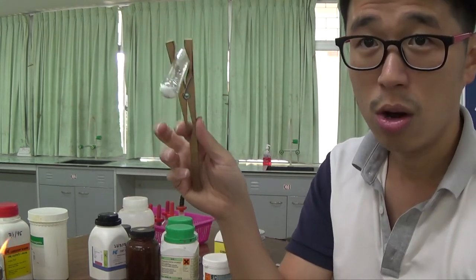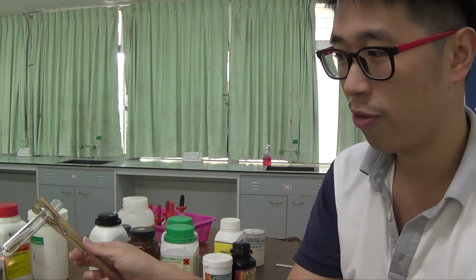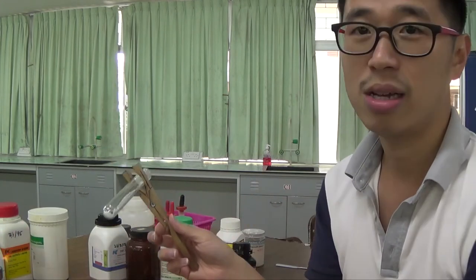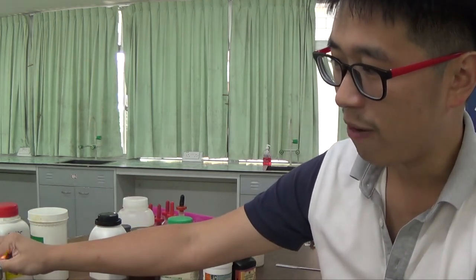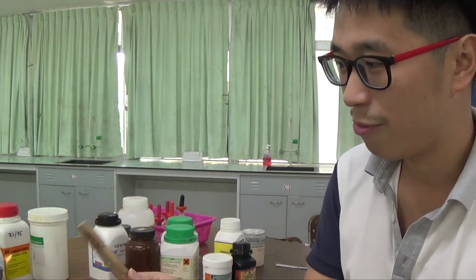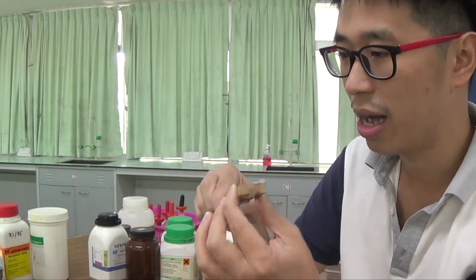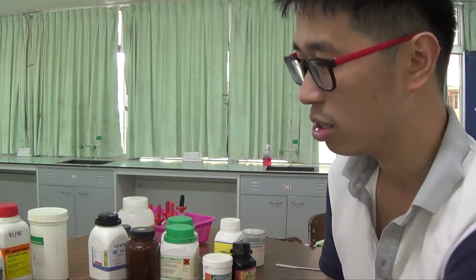Whatever you do, after you heat it very strongly on the Bunsen burner with the blue flame, do not wash with water straight away. Hot glass and water will break, okay? So leave it to cool. Because you're dealing with fire, make sure that you are very careful with fire. Make sure you use a test tube holder that can hold the test tube tightly so that you don't break the test tube, and you're not going to touch the hot test tube, all right?